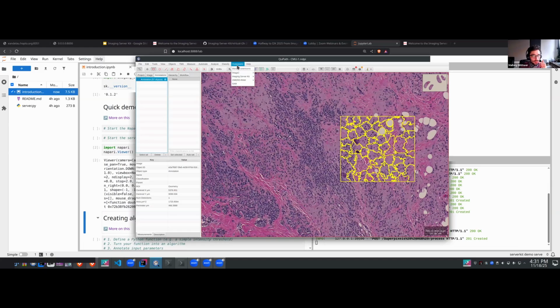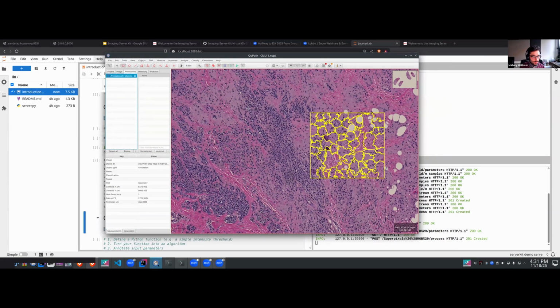Yeah, so by the way, all of the examples from the demo won't work in QuPath. So QuPath has no way of understanding what the result of the Fibonacci sphere, for example, would be like. So it's compatible with segmentation outputs, which can be represented as polygons, or points outputs. That also works. And I believe also bounding boxes that should also work. I think these are the main use cases for QuPath anyway. But yeah, that's where we are at the moment.